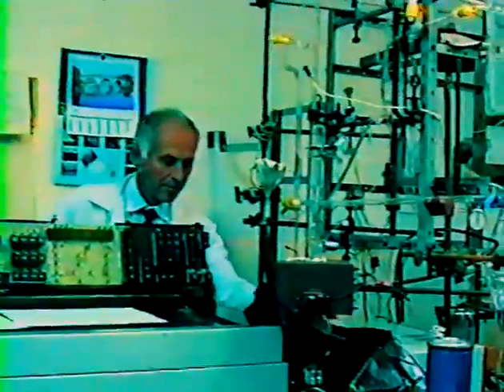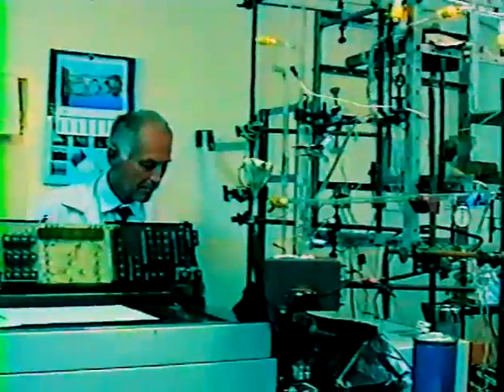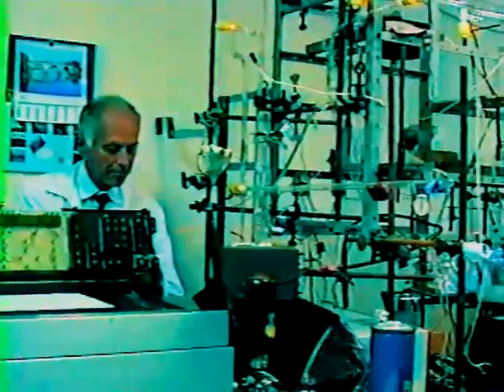This latter one is connected with another system investigated by our co-workers catalytically, I mean in the classical catalytic method.